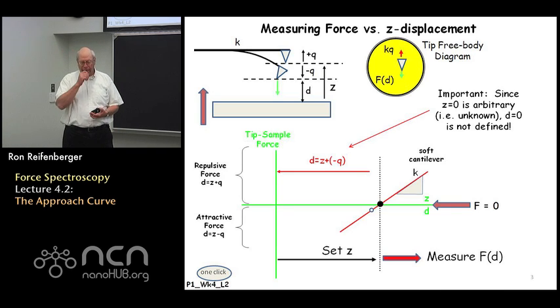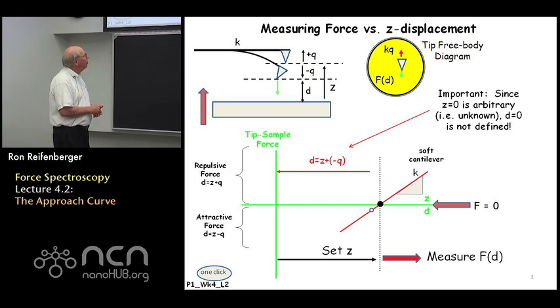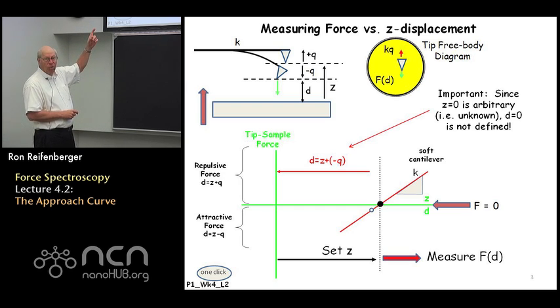So to begin with, I'd like to first of all clarify the coordinate system and the convention that we're going to follow regarding the polarity of q.